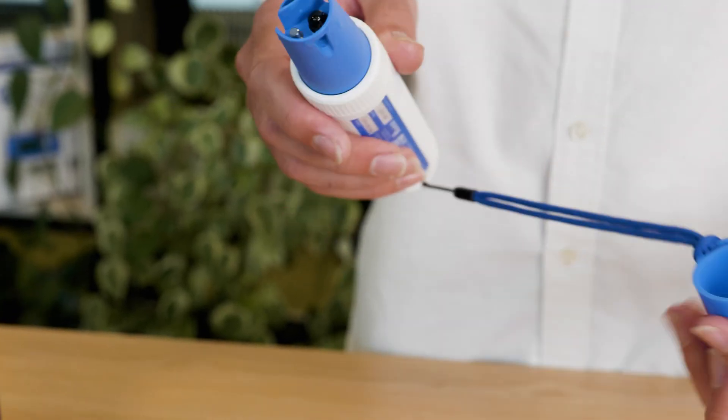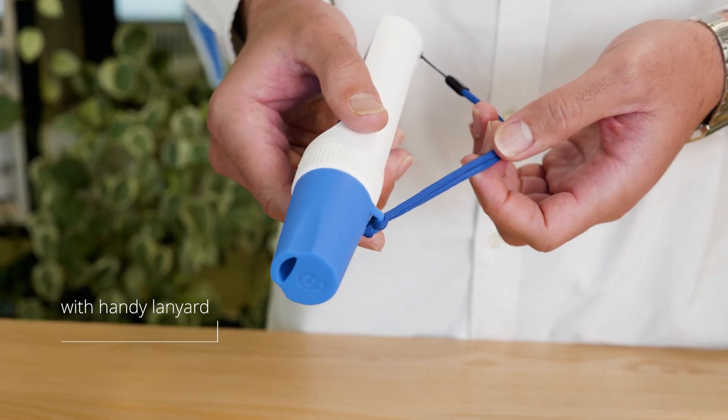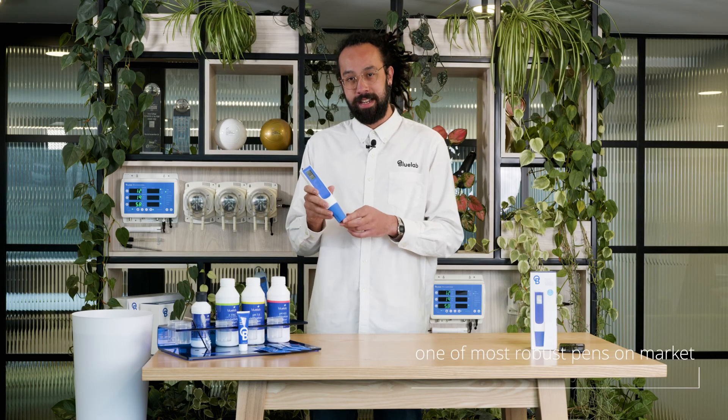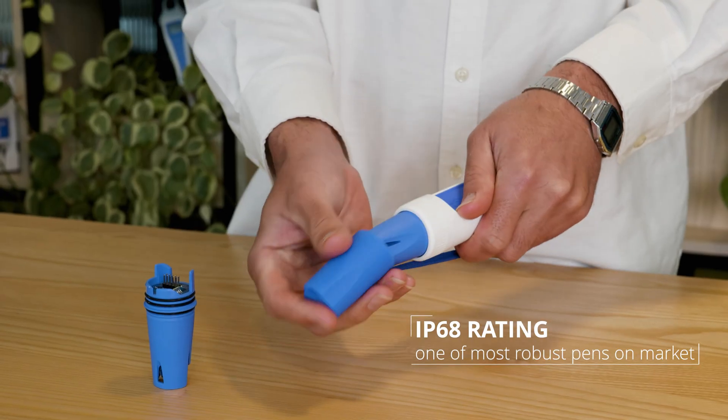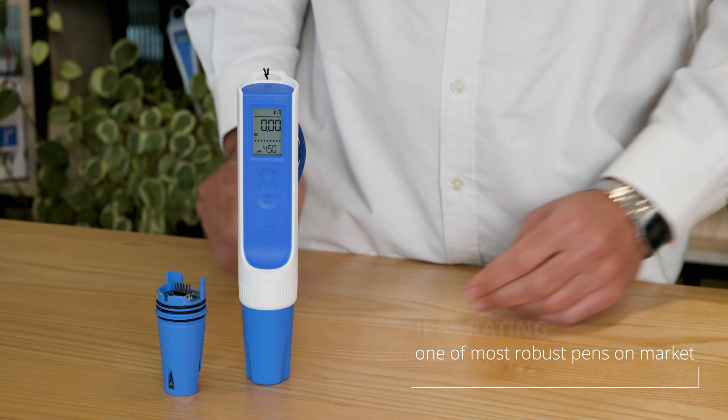We've even included a silicon storage cap with a handy lanyard to keep your probe safe and sound. IP68 rating — this pen is built to last. Certified waterproof and dustproof, making it one of the most robust pens on the market.